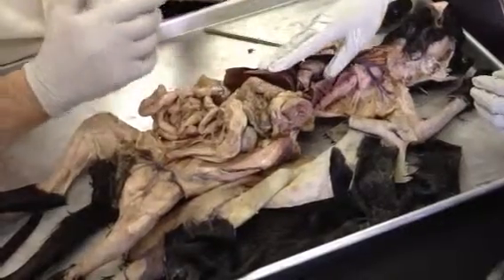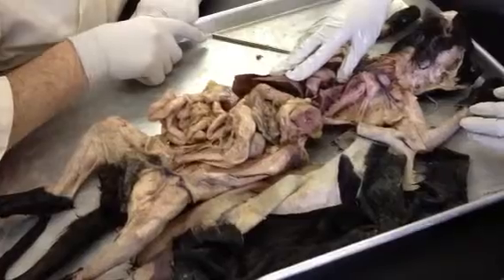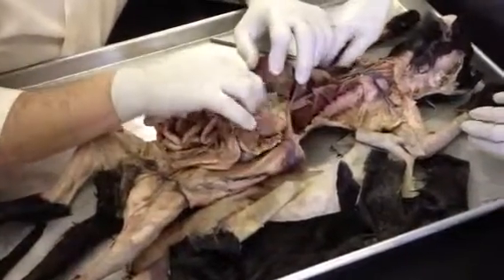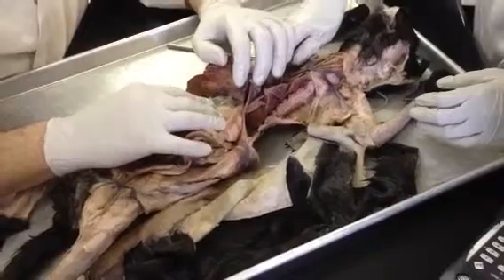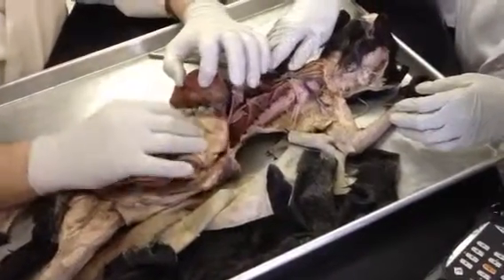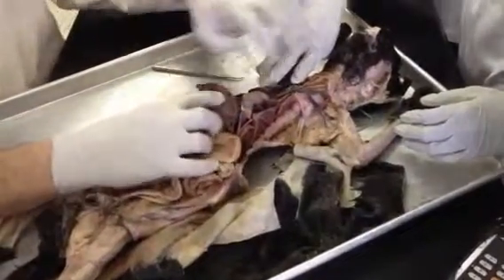I know that there's stuff on the list, do we have to know on the cat the common bile duct and... Yep, I don't know if I can show you that, but I'll show you where it is. The common bile duct travels through the lesser omentum, between the liver, the gallbladder, which is right there nested in the liver, and the duodenum. Through the lesser omentum.